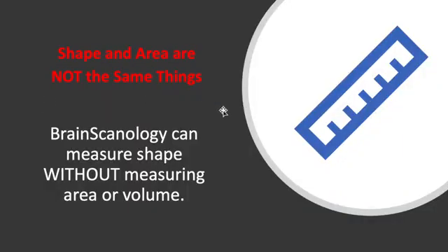To conclude, I want to reiterate my main point, that is, shape and area are not the same things. At Brainscanology, we can measure shape without measuring area or volume. And what we find across the board is that shape provides much cleaner data than does area or volume.